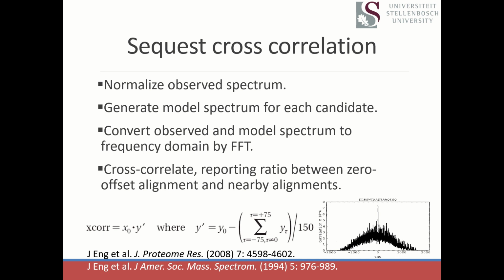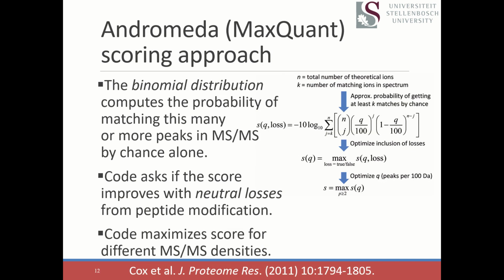That was published in 2008, and that model is still used in things like Comet, for example, and Sequest HT. So for all those 14 years, imagine how much faster people could have been finding their results for their data sets if only that math error had been spotted sooner. Awkward. I'm aware that a lot of people here are familiar with the MaxQuant algorithm from Matthias Mann's lab.